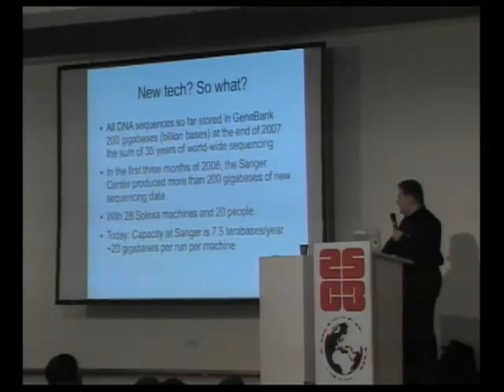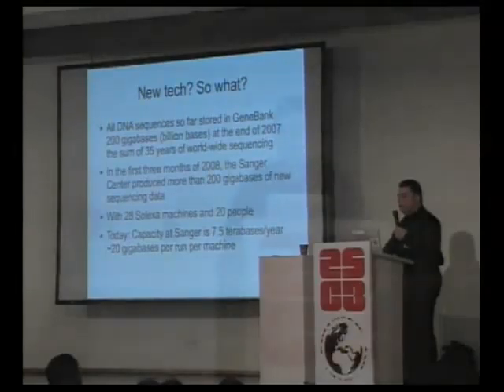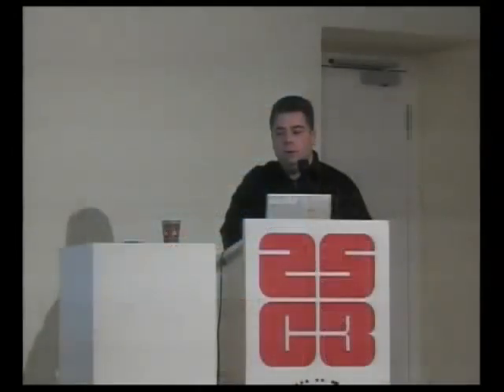So you can see how this is changing, and it is changing, and whole new modes are becoming available right now. So they're increasing the read lengths now from 35 or 37 to 50. I've seen 50, works very well. There are apparently trials with 76 and even 100, which would put this in the same ballpark as the original Sanger sequencing, which made one of these reads per run, and this does like 9 million per run.